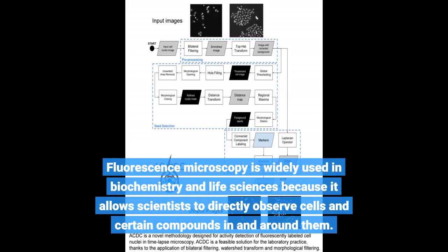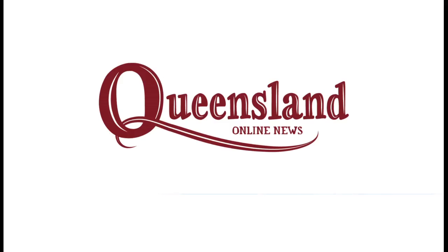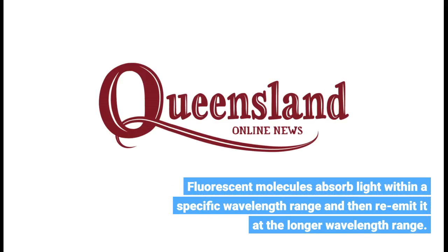Fluorescence microscopy is widely used in biochemistry and life sciences because it allows scientists to directly observe cells and certain compounds in and around them. Fluorescent molecules absorb light within a specific wavelength range and then re-emit it at a longer wavelength range.